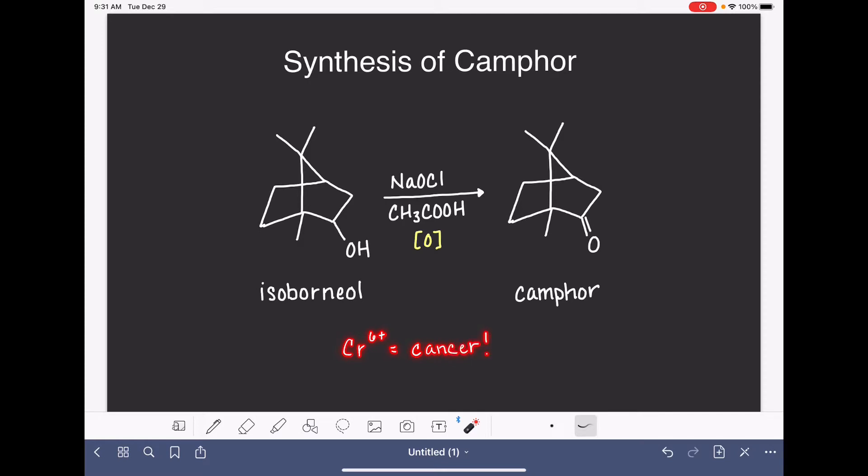So instead of using these chromium-6 reagents, we're going to be using sodium hypochlorite, NaOCl. This is the active ingredient that is found in household bleach, like what you would use in your laundry, and then a little bit of acetic acid, CH3COOH.